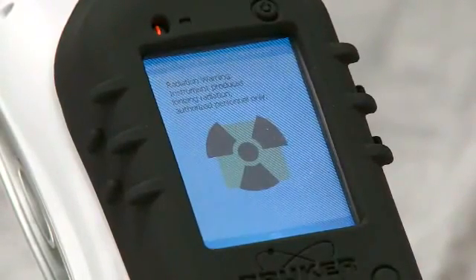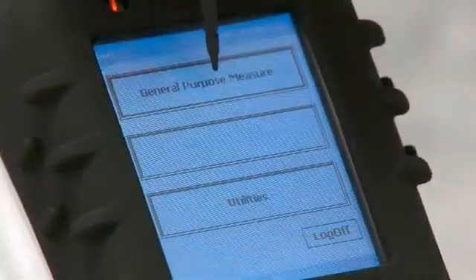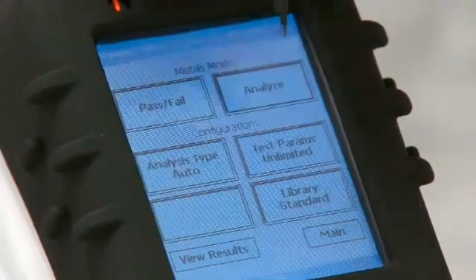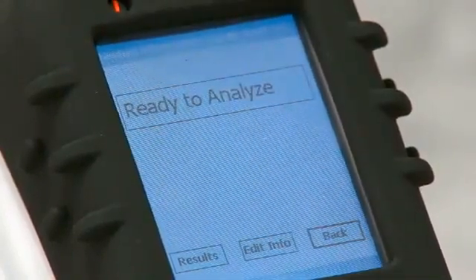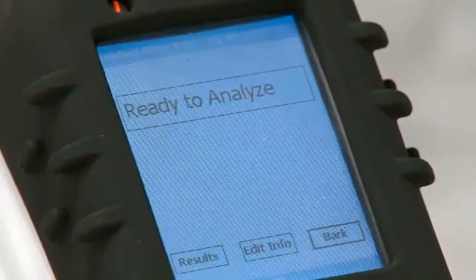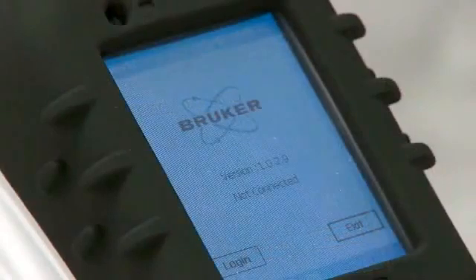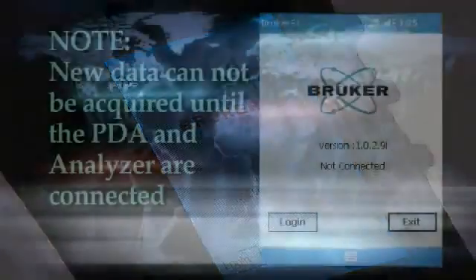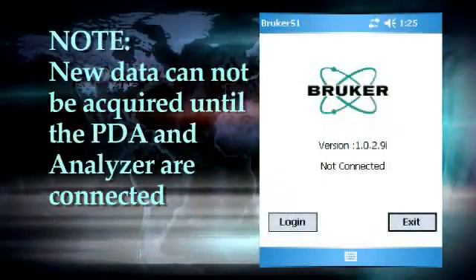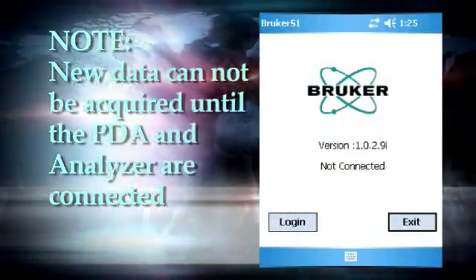If the instrument does not go directly to the ready to analyze screen, tap the general purpose measurement button to place the analyzer in the universal mode for taking general alloy measurements. After that, the analyzer goes to the ready to analyze screen and you are ready to make a measurement. Note: if the PDA and analyzer do not connect, you will see a message on the screen. If this occurs, you can log in and manipulate data on the analyzer, but the analyzer will not be able to acquire new data.